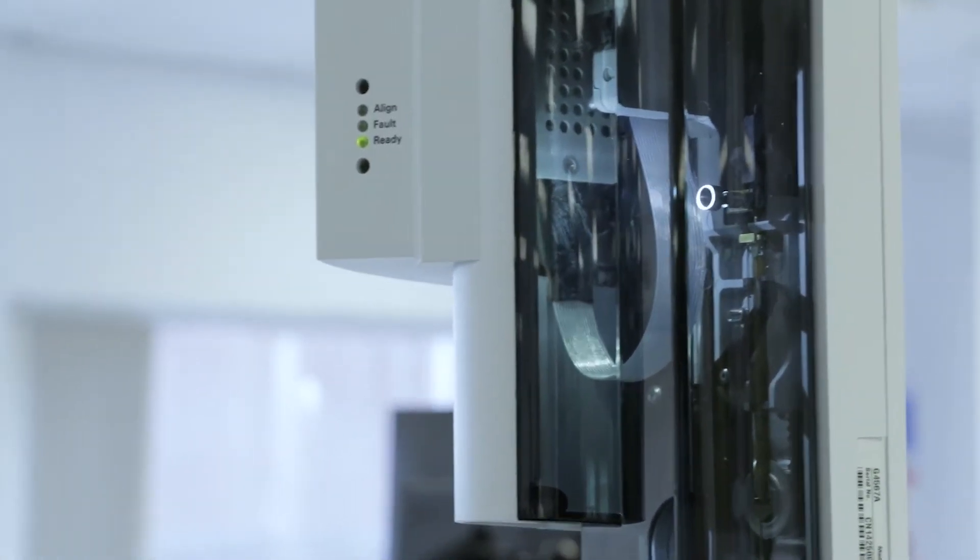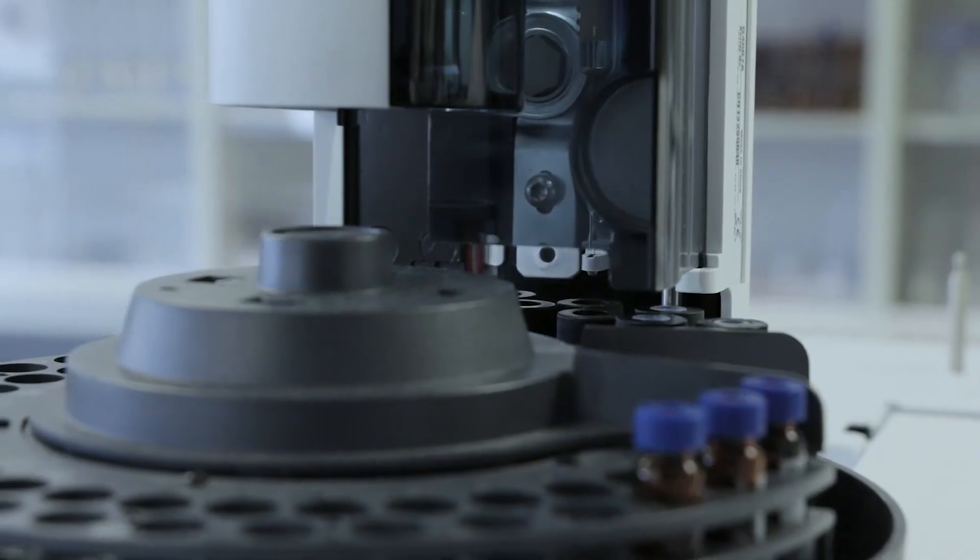These are our gas chromatographs. We have a flame ionisation detector and a mass spectrometry detector. We use these to screen liquids for trace compounds.